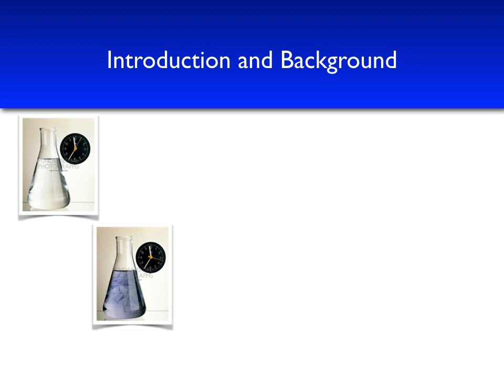What is an iodine clock reaction? Well, a clock reaction is where we mix together several reagents that form a complicated reaction system that are colorless in solution. And in a very easy to measure specific amount of time, we get a color change as products are formed. Iodine is typically used in clock reactions because I- is colorless in solution, and elemental iodine, I2, is a brownish yellow color in solution.